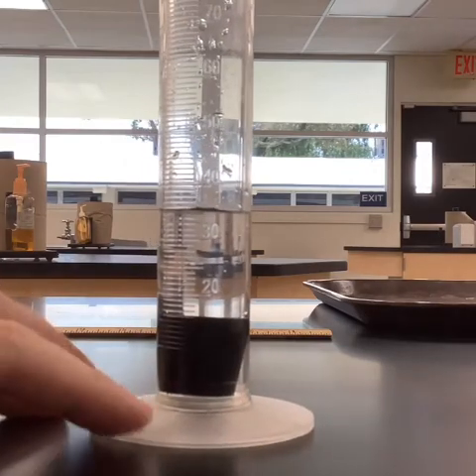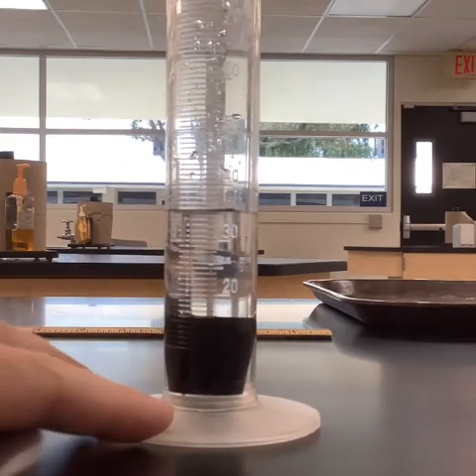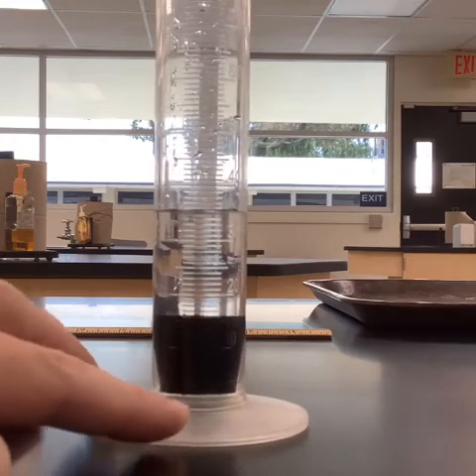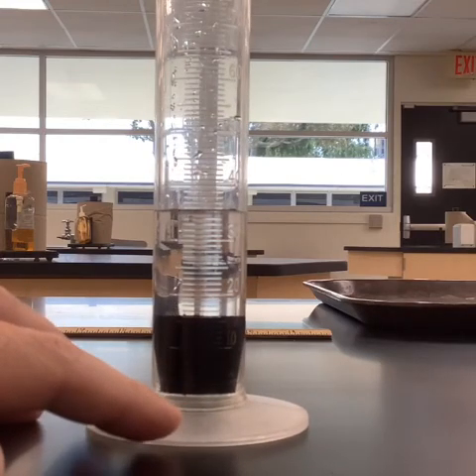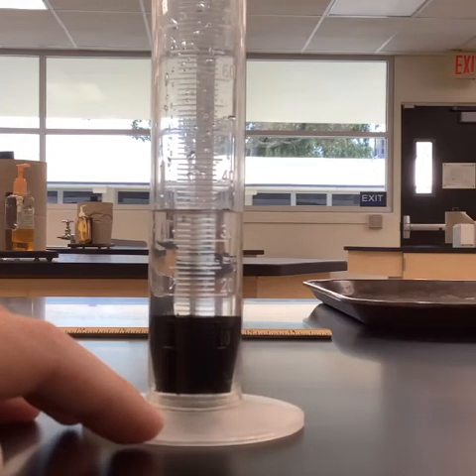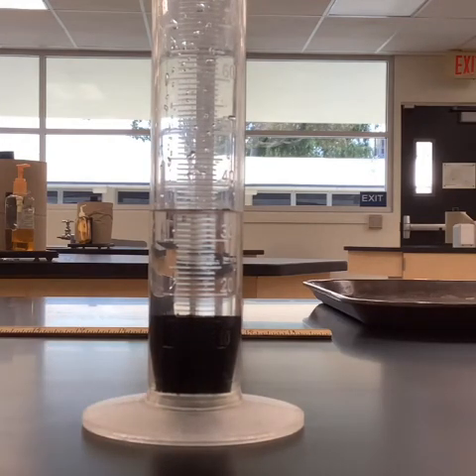But now we can see that the volume has changed pretty significantly. So you need to record the new volume. Okay, so what would you put this volume at? Okay. So we should have all of the information that we need right now for our rubber stopper.